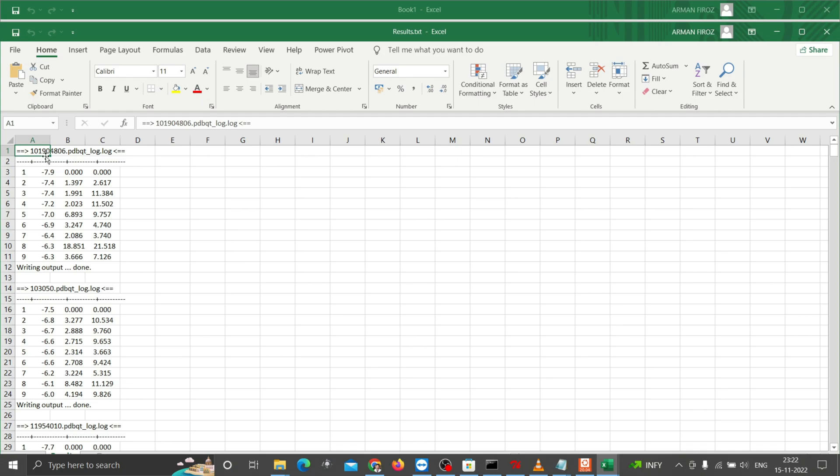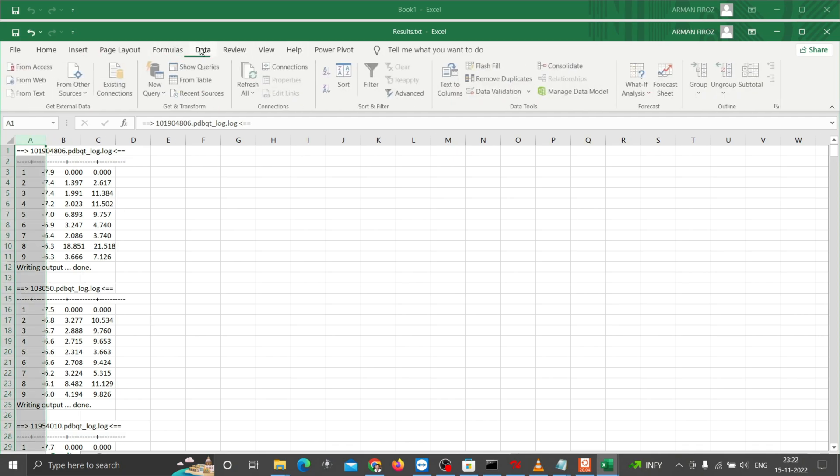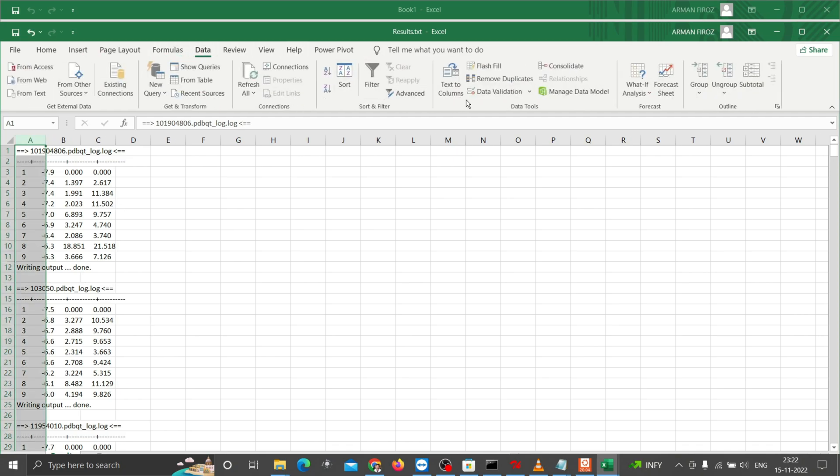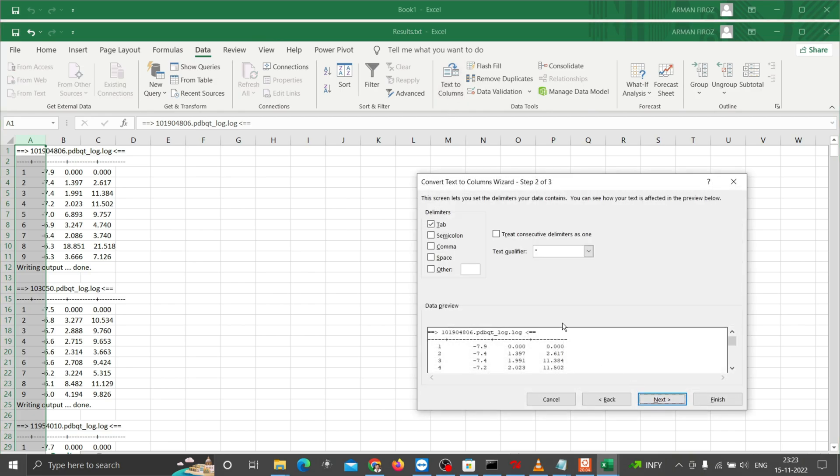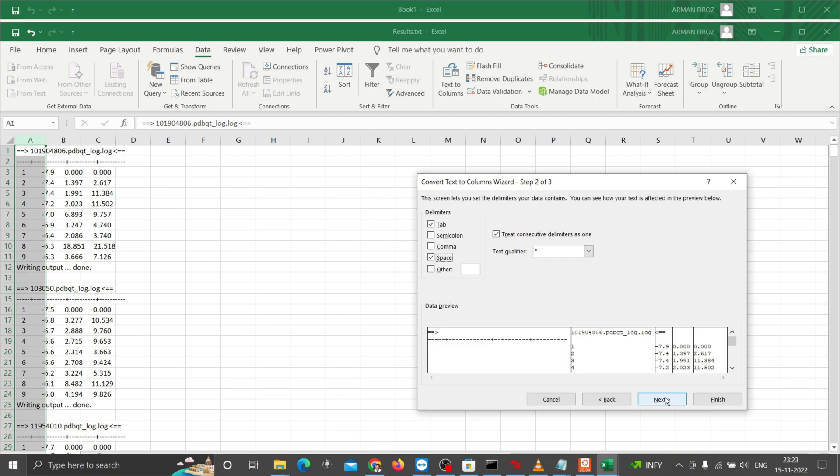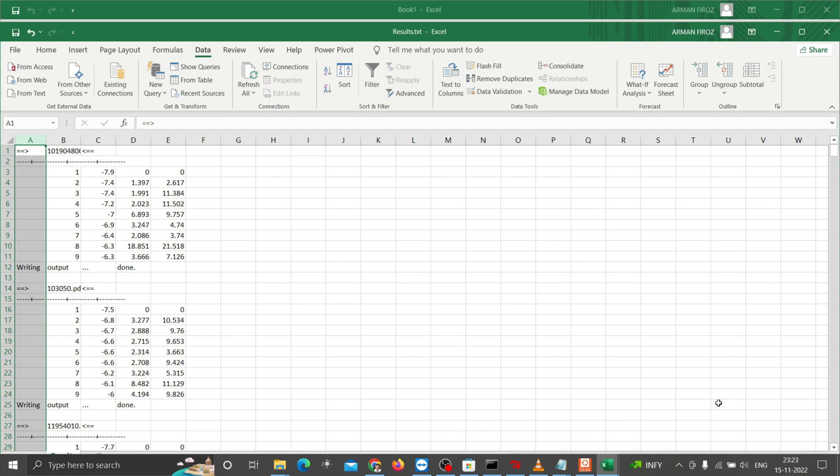Open the text file in Excel, select the first column and click on Data, then Text to Columns. Mark delimiters and click next. Mark both tab and space for separating the results to multiple rows based on these delimiters. Click finish. Now you can see the results split into multiple columns.